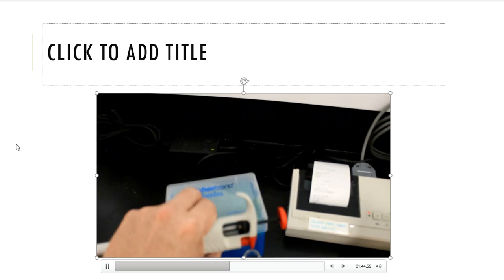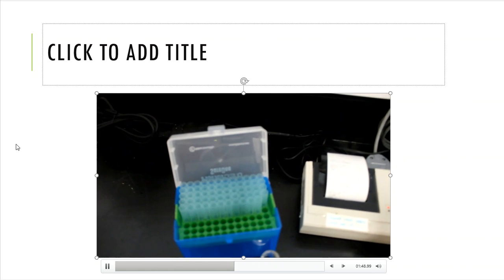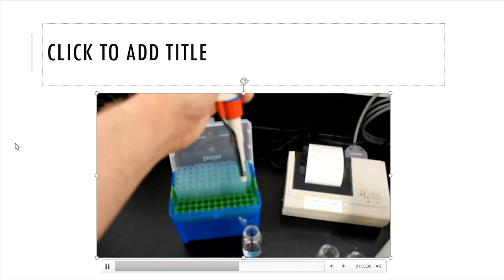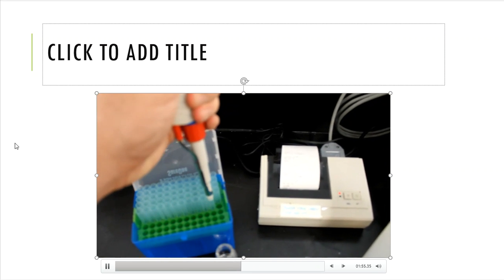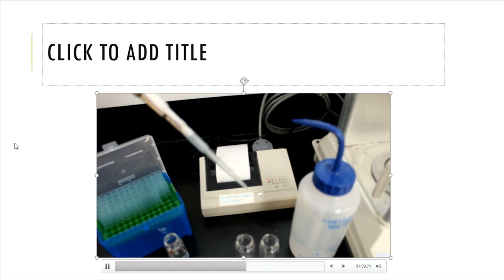These are our micropipette tips. I'm just going to open up the container. You can see all the tips that are ready to be loaded there. I'm going to take the micropipette and literally push it down onto one of the tips and then bring this up. And now you can see this is now loaded.